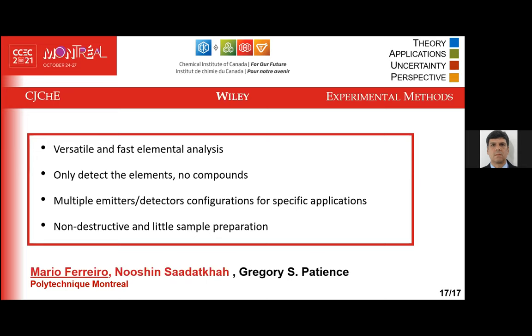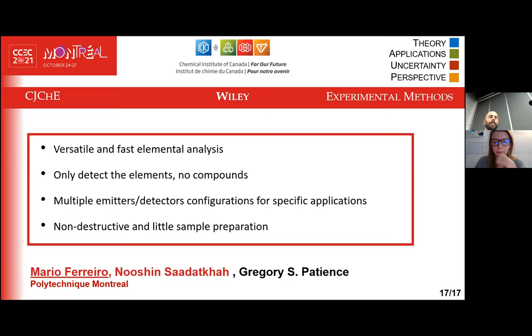You just need to do a small sample preparation. It's not destructive, so you can reuse your sample for other analysis. And really, you just need to create a disk or something homogeneous, and it won't be that difficult. So I think that would summarize everything.